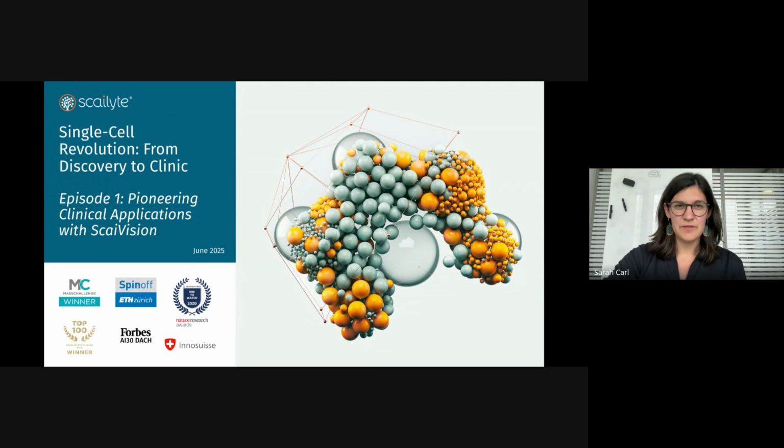We wanted to create this video series to emphasize the potential of single-cell data for the pharma and biotech community, as well as to present how we're driving the use of single-cell technologies forward into real clinical applications and ultimately patient impact. Today, I want to give you a bit of background on single-cell technologies and then give an overview of ScaiVision with a focus on the pre-processing steps we use to ensure high-quality data and give the best chance for successful discoveries.